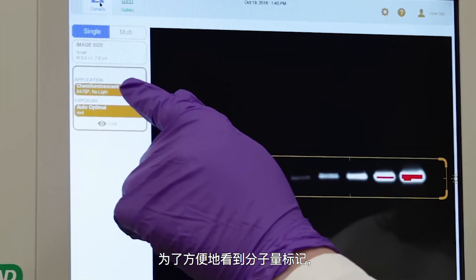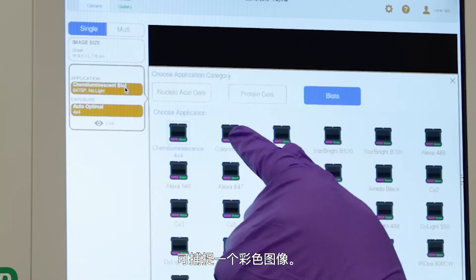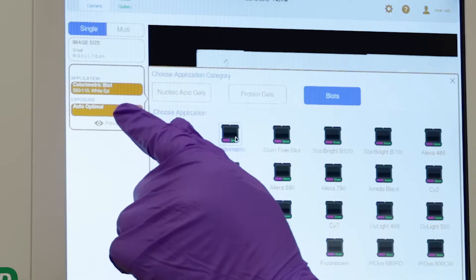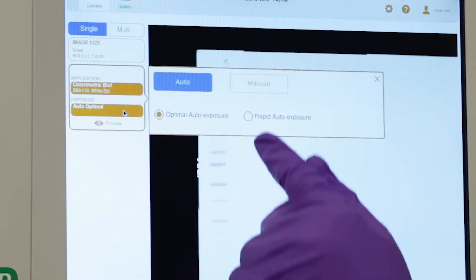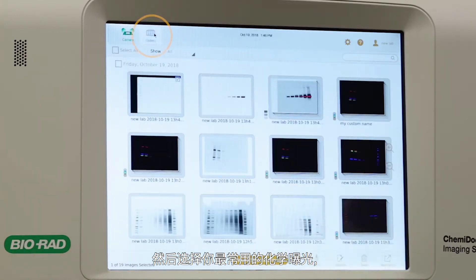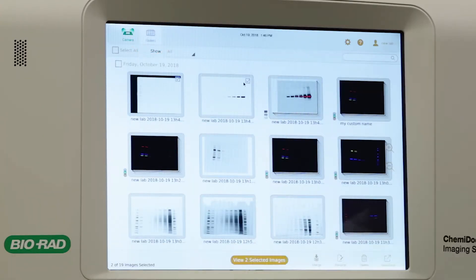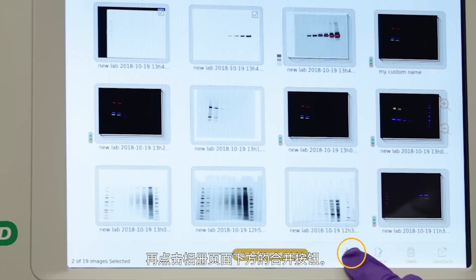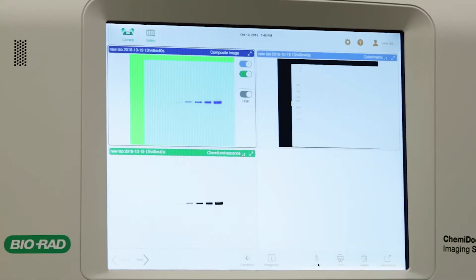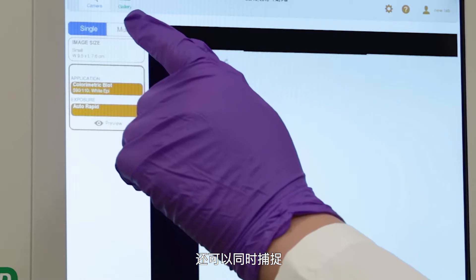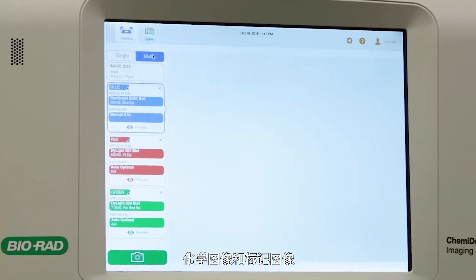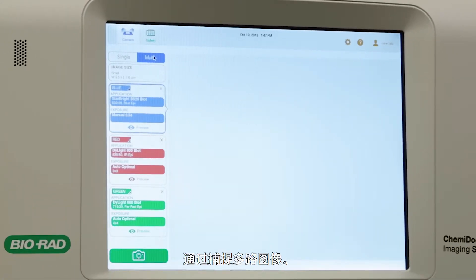To see your molecular weight marker easily, capture a colorimetric image. Then select your favorite chemi exposure and tap Merge at the bottom of the gallery screen. You can also capture the chemi image and an image of your marker at the same time by capturing a multi-channel image.